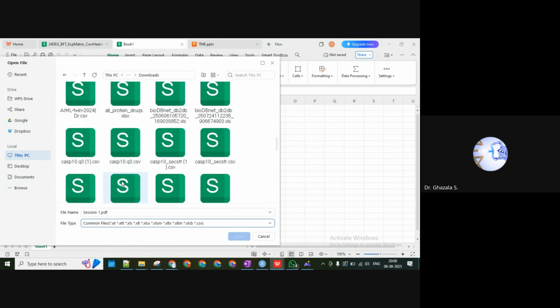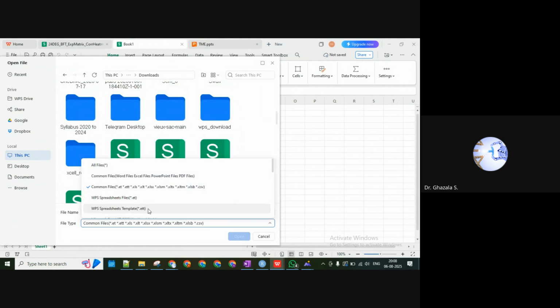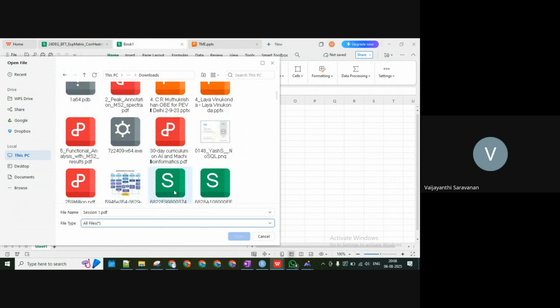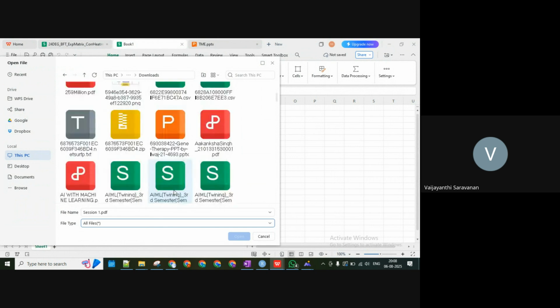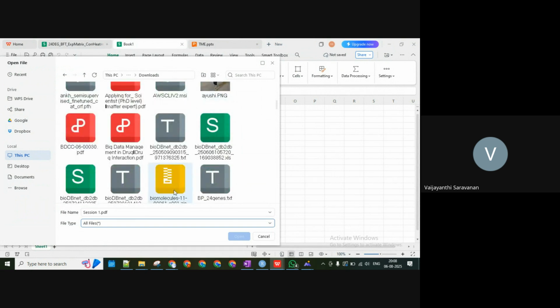So is it clear what I'm saying? As for now, it is clear. So I will just check the biological process, and I will just go for the correlation with the known genes in the same STRING database.